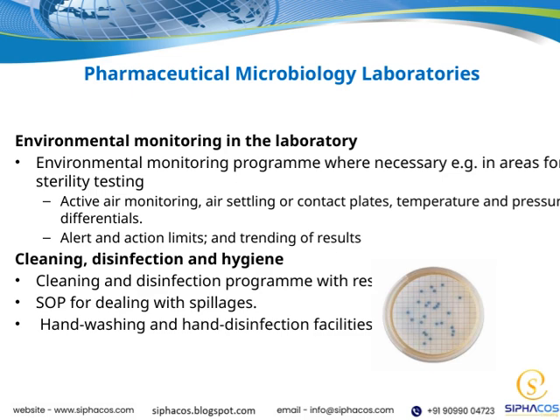Finally, proper hand hygiene facilities, such as hand washing and hand disinfection stations, are crucial. They play a key role in preventing the transfer of microbes into the controlled environment, safeguarding the integrity of our products and the safety of our patients.